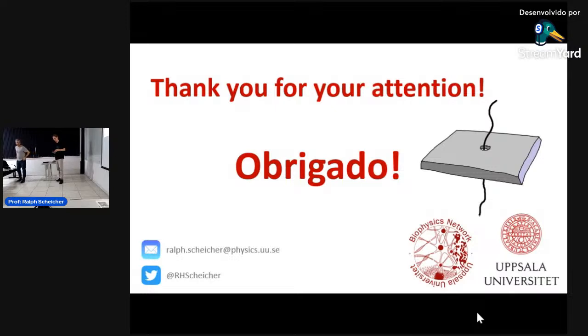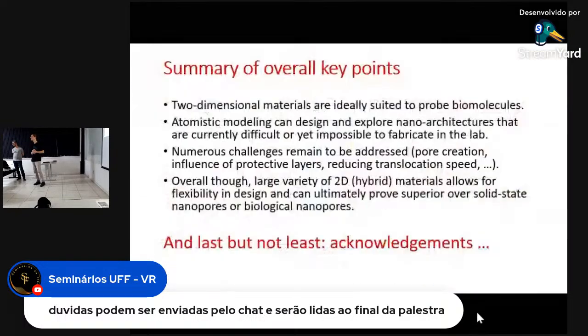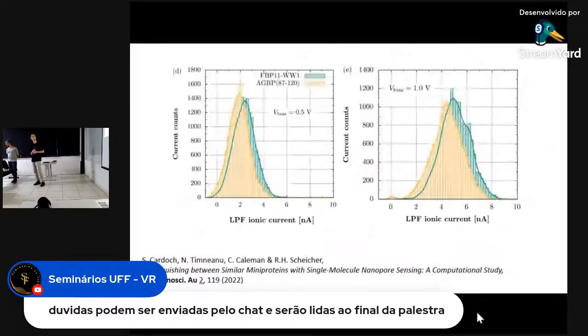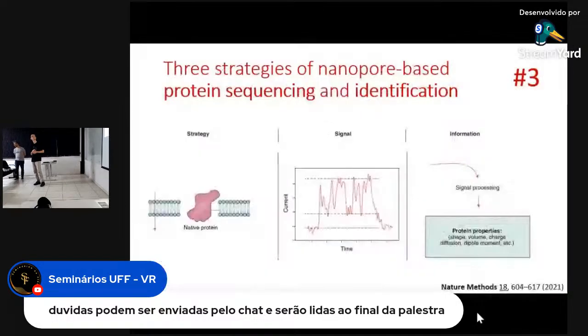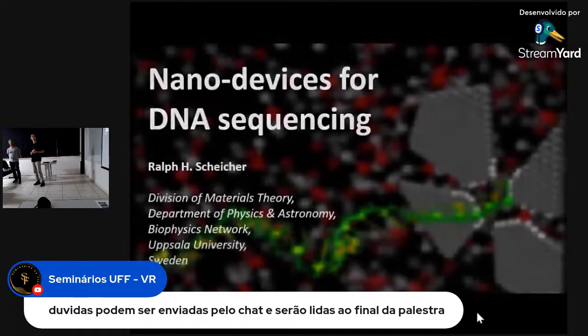Thank you all for the very nice talk. Questions? I have one. Thank you for your talk. It was a very nice one. The slides were certainly beautiful. And I have a question about the geometry of the nanopore. Let's talk about the graphene and the biological nanopores. I wish to know how does the difference of the geometry of the nanopore influence the DNA sequence detection?